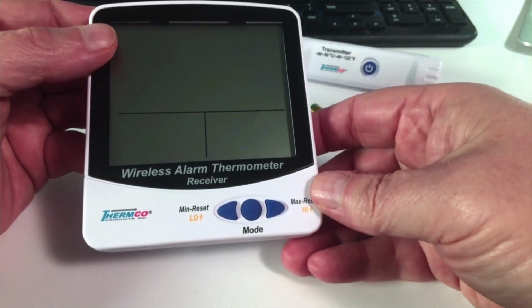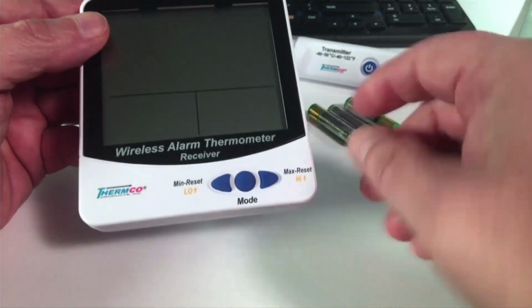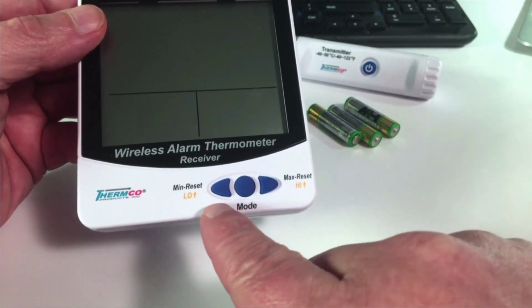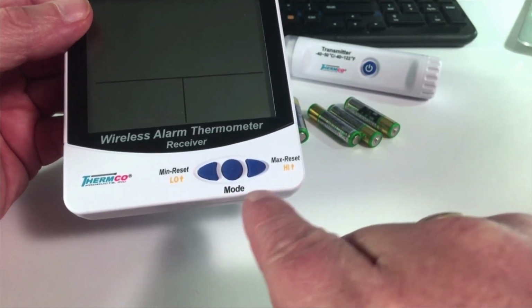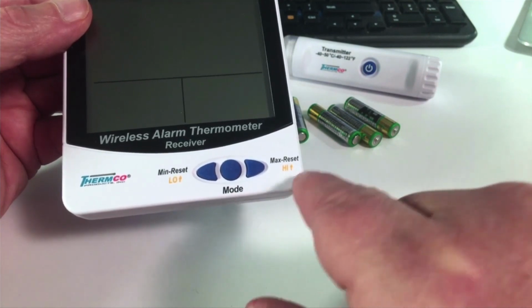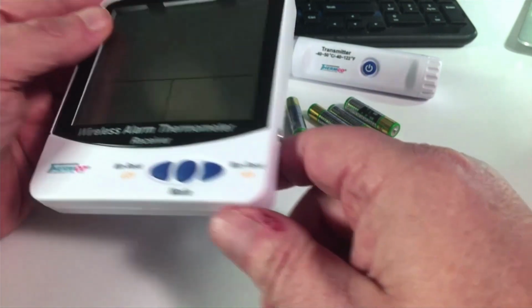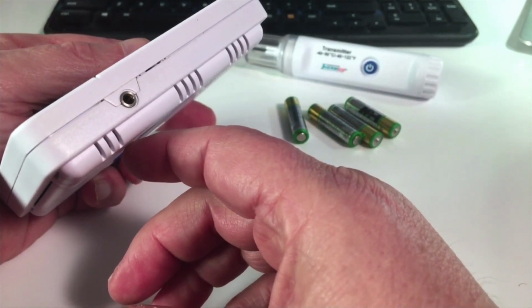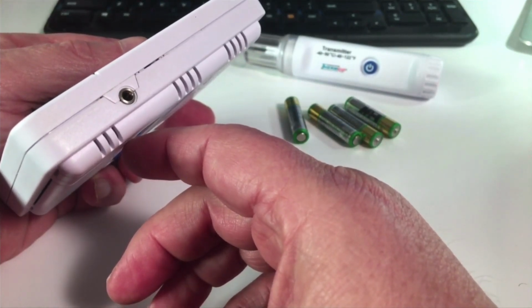This is the receiver monitor. You have 3 buttons on the front. One says min reset low, in the middle mode, and to the right of that max reset high. We'll discuss these buttons later in the video. On the right hand side you have a 3.5 millimeter jack that is for wired sensors.